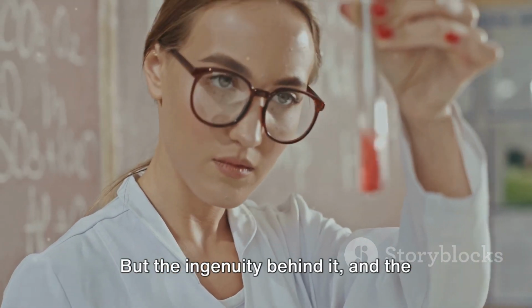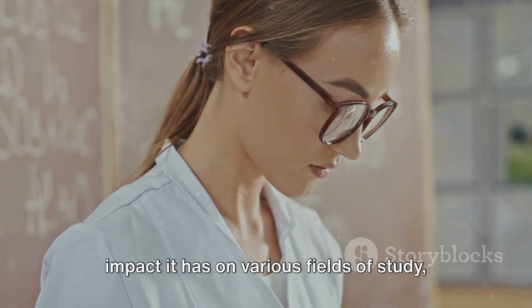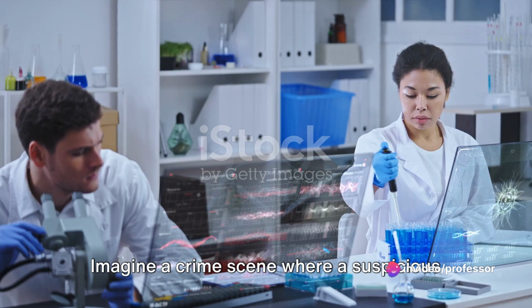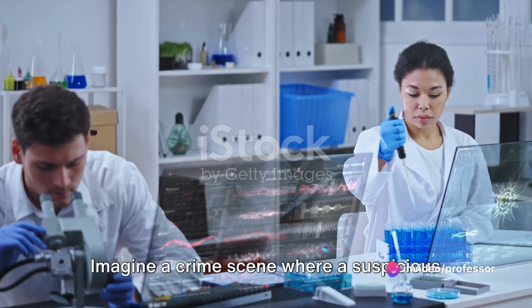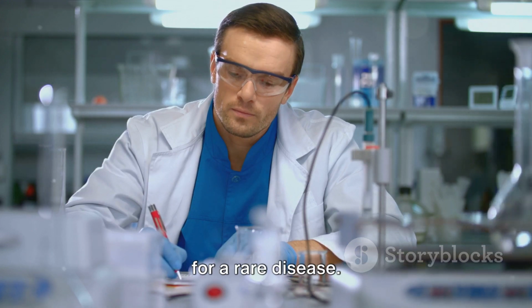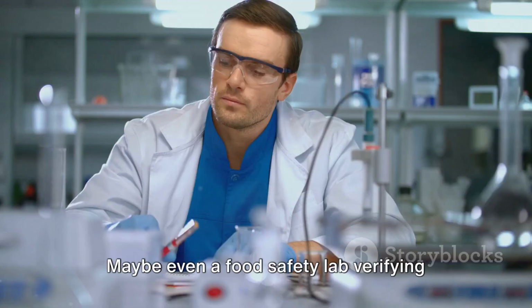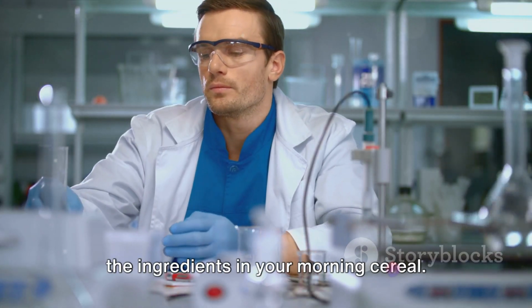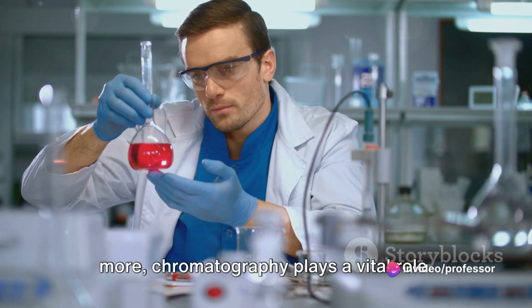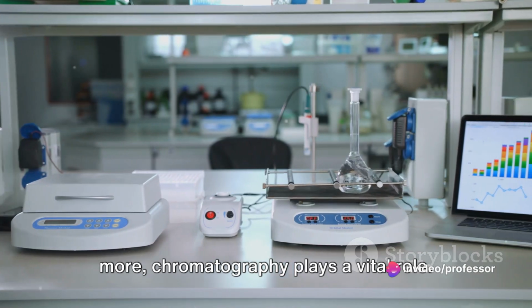But the ingenuity behind it and the impact it has on various fields of study is anything but simple. Imagine a crime scene where a suspicious substance is found, or a medical lab testing a blood sample for a rare disease, maybe even a food safety lab verifying the ingredients in your morning cereal. In all these scenarios and countless more, chromatography plays a vital role.